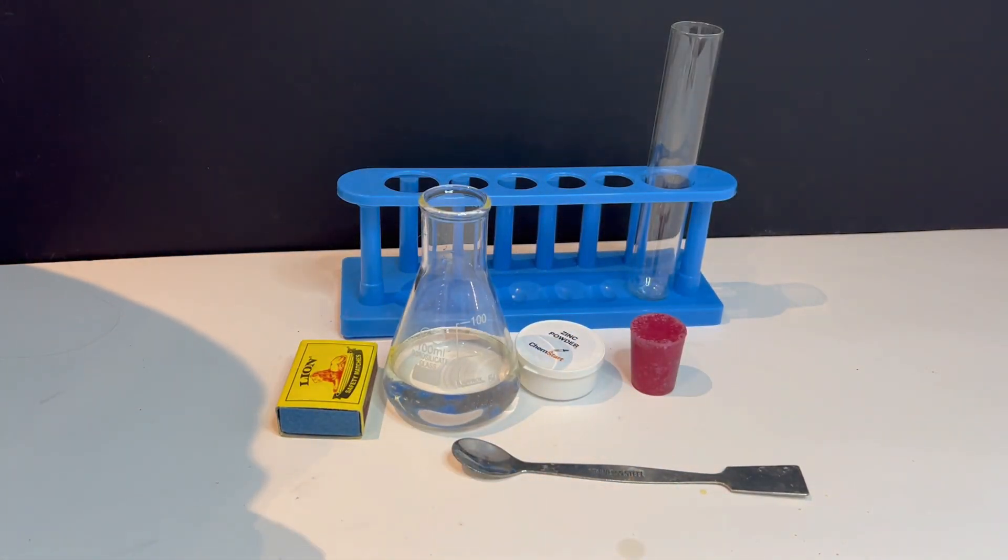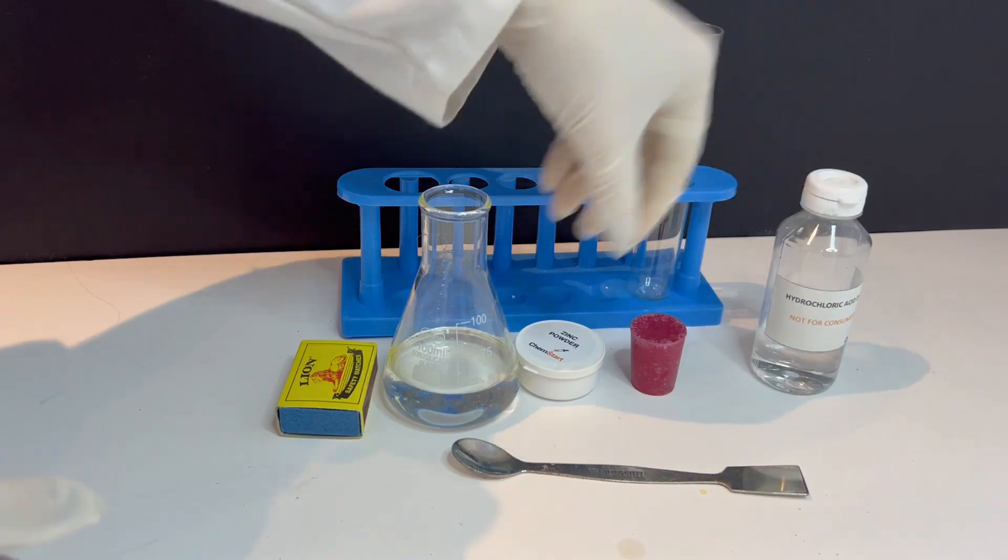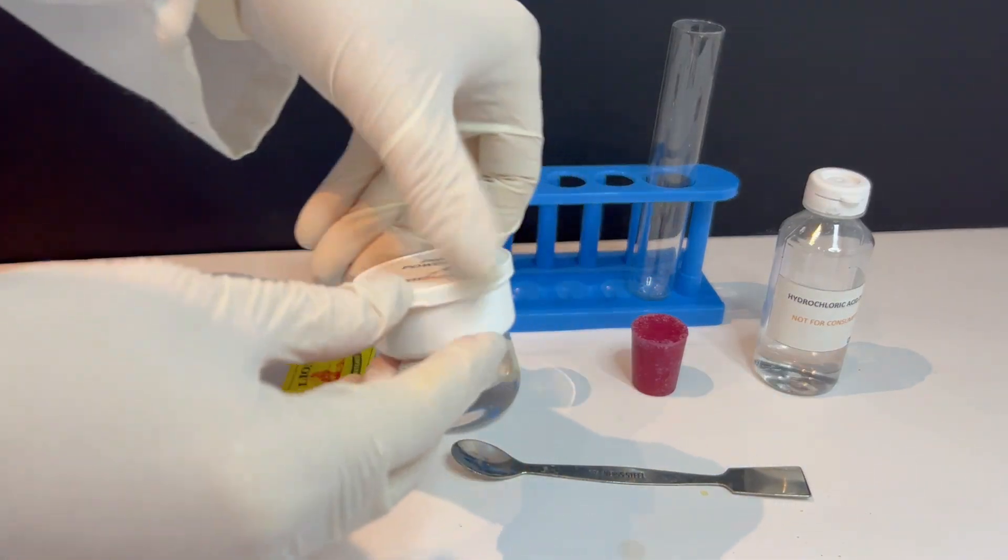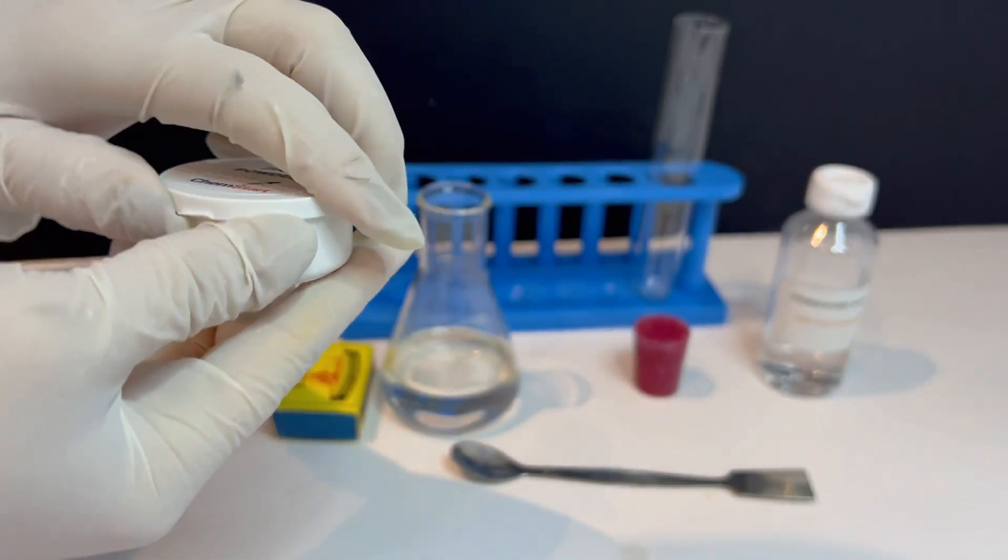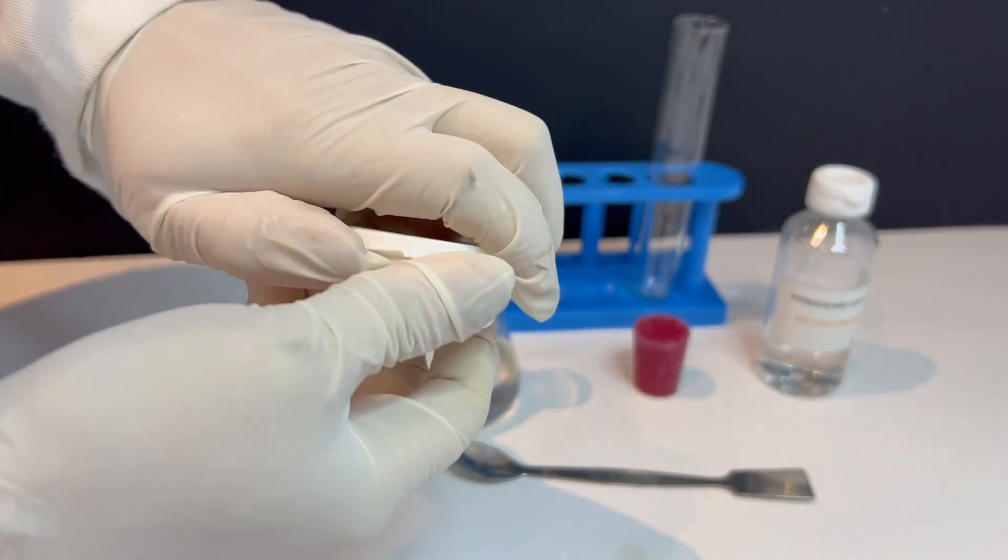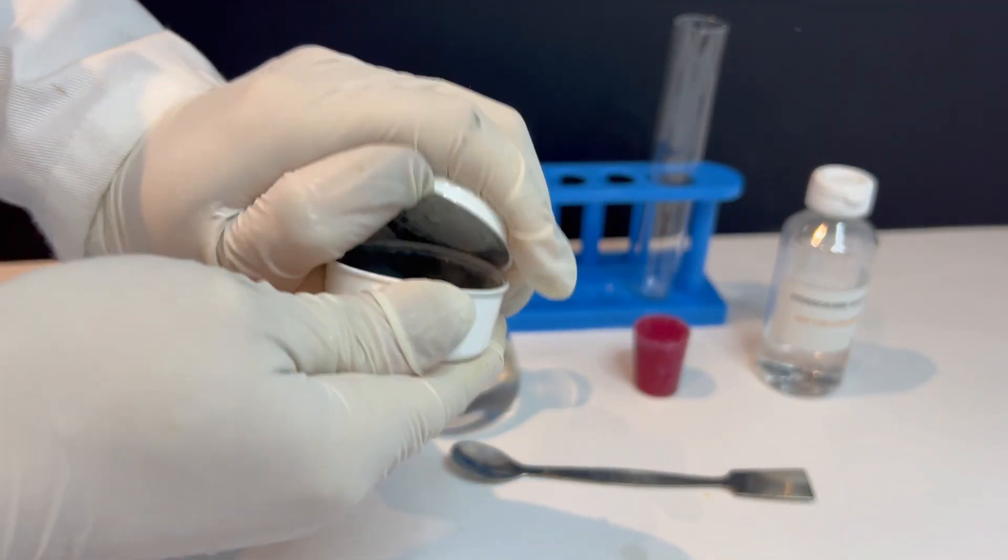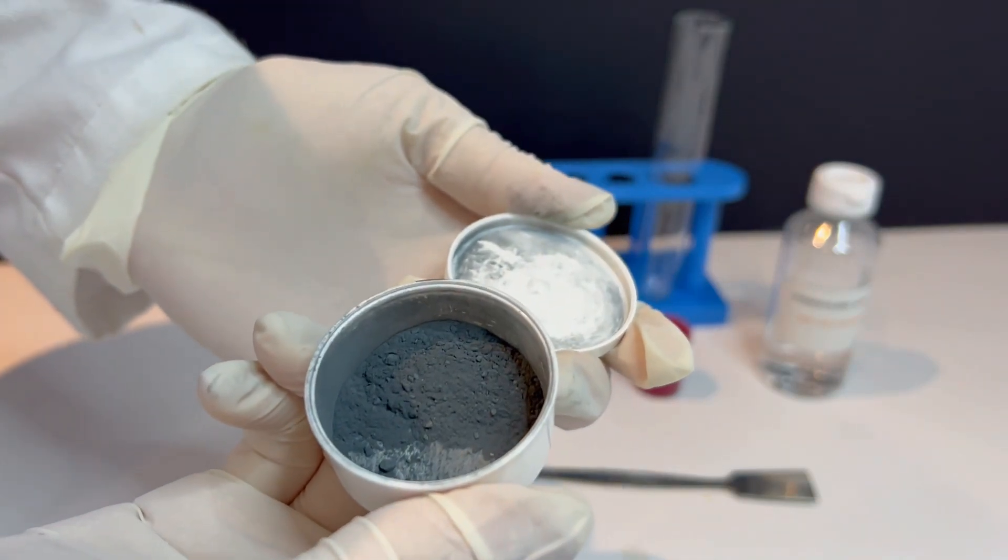Next, add a small amount of zinc powder to an Erlenmeyer flask. Remember, zinc is a metal, and in powdered form it reacts faster because it has a large surface area. That means we'll see results quickly.